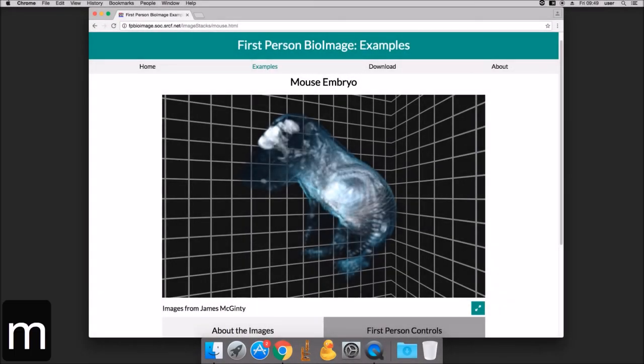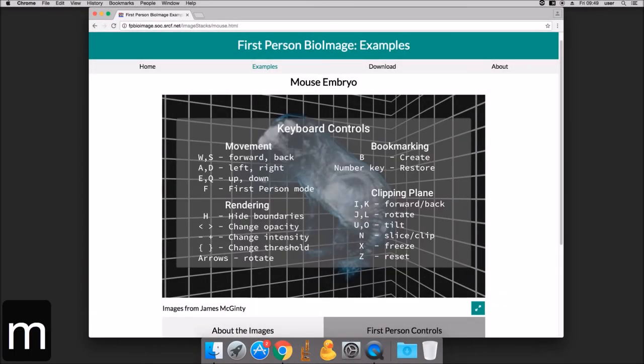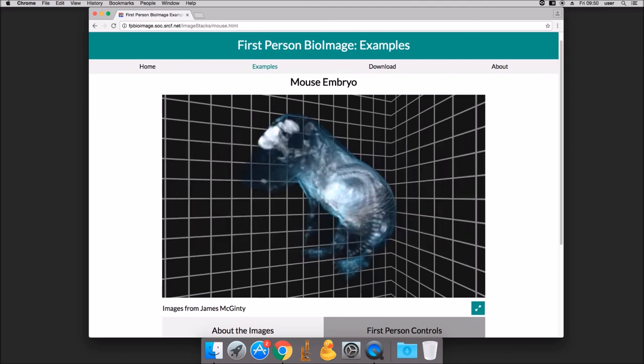View a full list of keyboard controls at any time by pressing M. To view more example datasets and for further information, please visit fpb.ceb.cam.ac.uk.